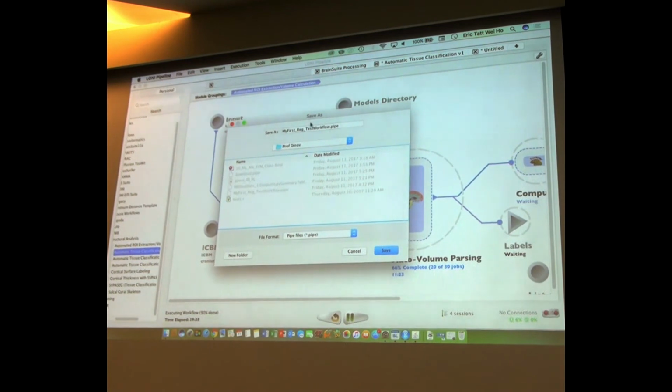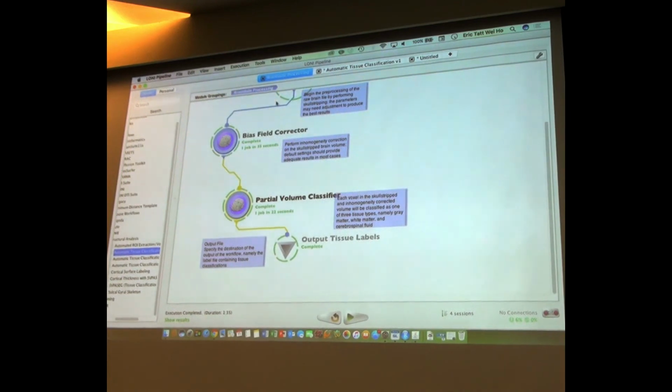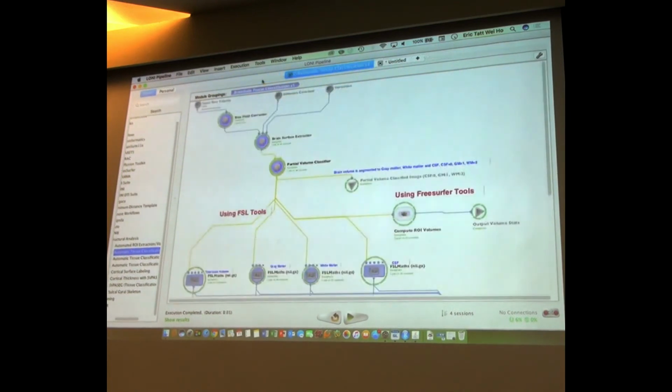So this is the auto ROI extraction. Okay, so I can close that safely. This one, we did this one, I don't have to save it. This one, we're done with that.